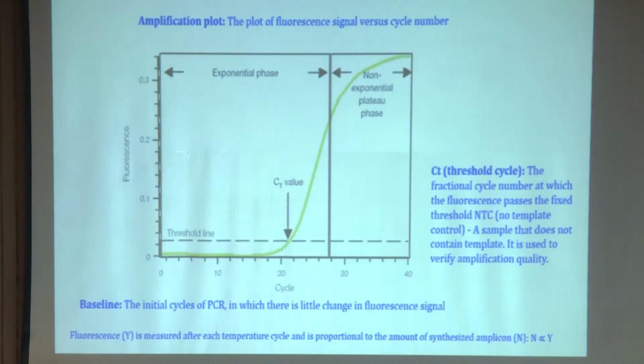And then of course, like a bacterial growth curve, we also have different phases of the amplification. That's what we call the amplification plot. This is the baseline region where the exponential phase will start, and this is also considered within the exponential phase. And then we have linear and then plateau. This is a non-exponential phase. Each brand has a different way of naming the amplification plot itself, right?